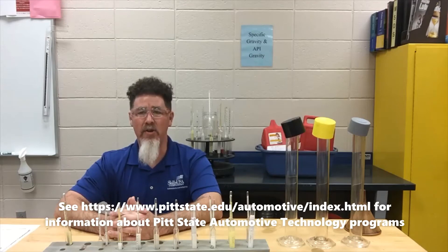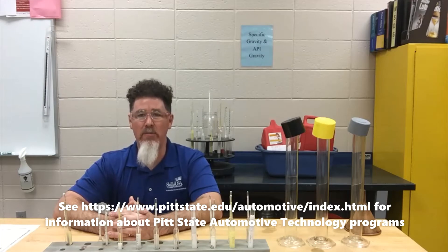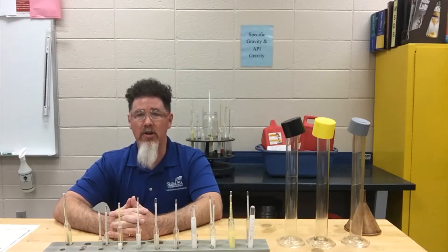Howdy, this is Professor Scott Norman at Pittsburgh State University. Today we are in the Department of Automotive Technology in our mobile fuels lab. We're going to be doing gravity measurements. I purchased in November 2020 a gallon of 91 octane, a gallon of 89 octane, and a gallon of 87 octane. We've already done some Reid vapor pressure testing, and today students are going to be measuring the gravities of these fuels.